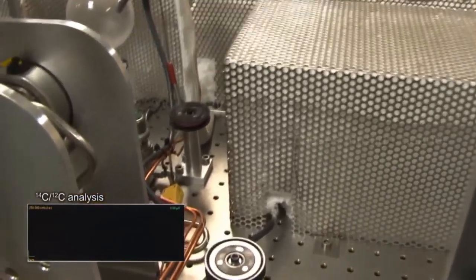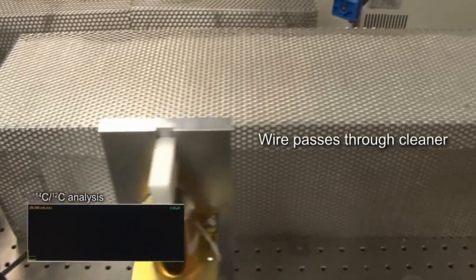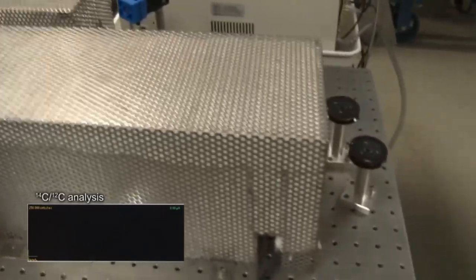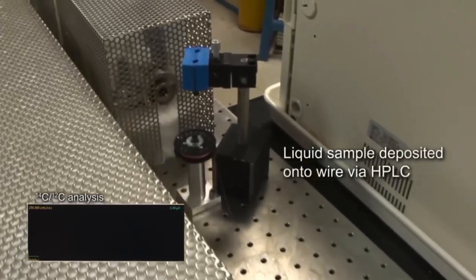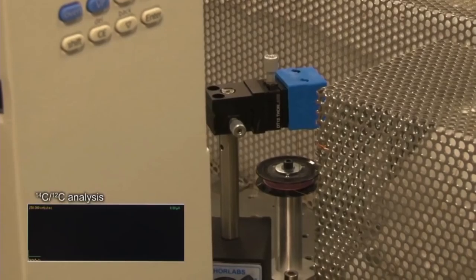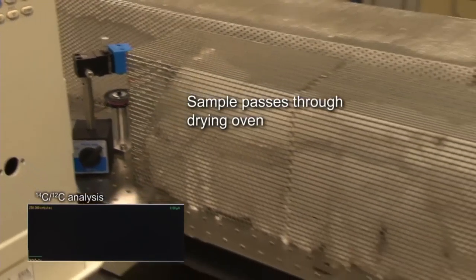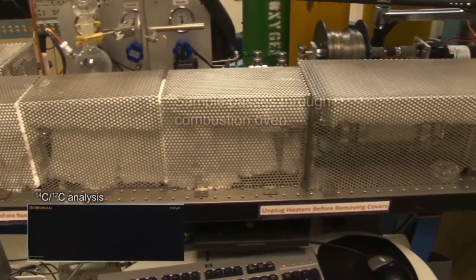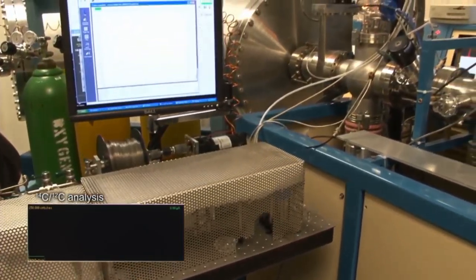So then as the wire goes through, it goes through what's called a cleaner, which is just like an oven. It heats the wire up, and it gets rid of any contaminants, things that are on the wire that might interfere with our analyses. And after it goes through the cleaner, the liquid sample that comes off the HPLC gets deposited as little droplets on this wire as it moves past. And that passes through another drying oven to get rid of any of the liquid that's on the wire. So all you're left with is just your chemical of interest stuck on the wire.